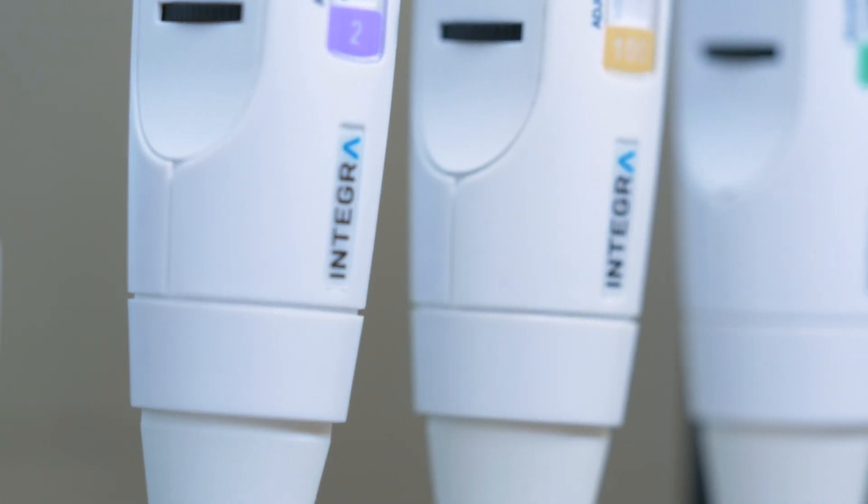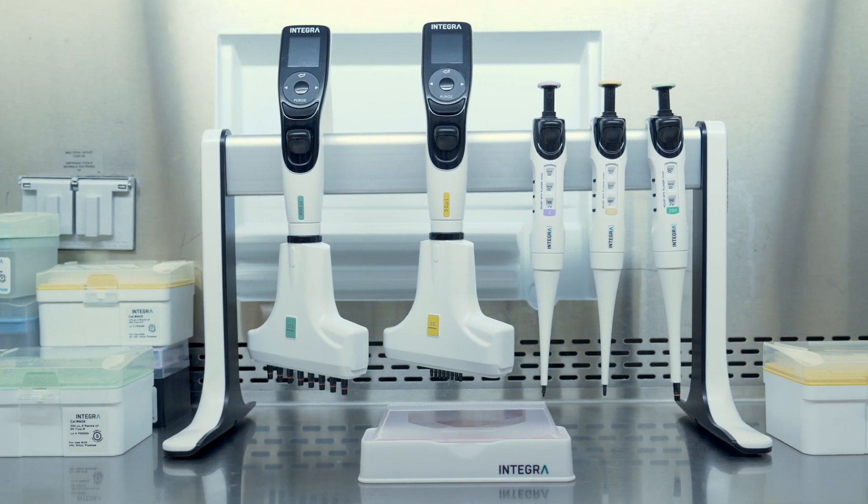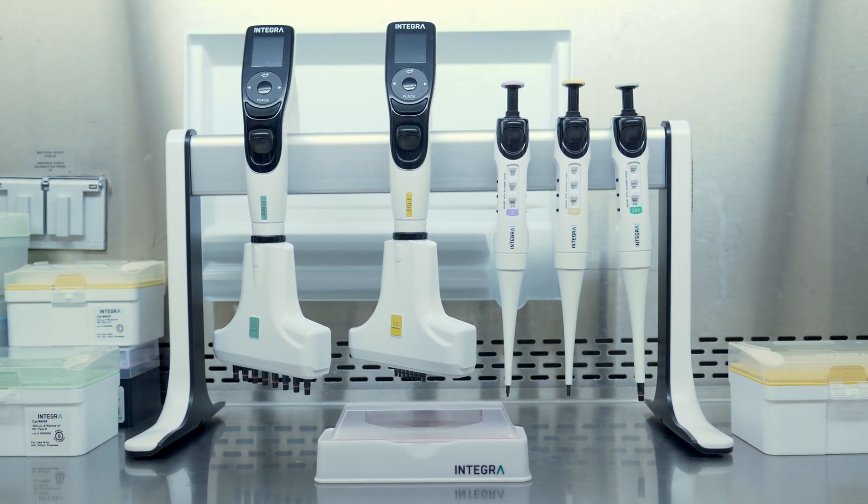I have been fortunate not to need much support from Integra over the years because these pipetters are incredibly robust — they just last forever. When I order tips they come rapidly and they're competitively priced. We have found the Voyagers very easy to handle, very robust. It basically never breaks.